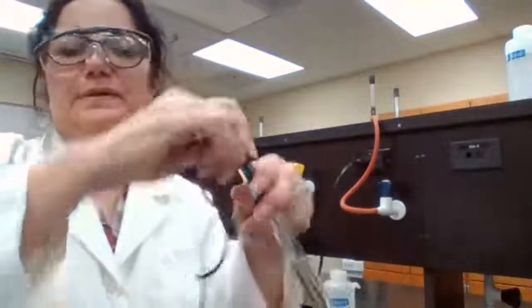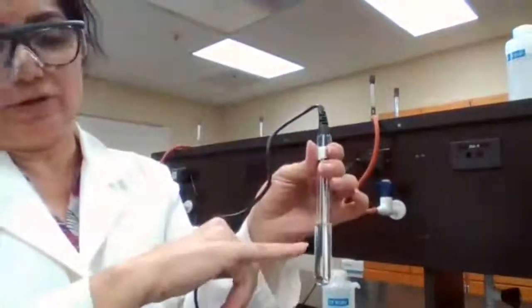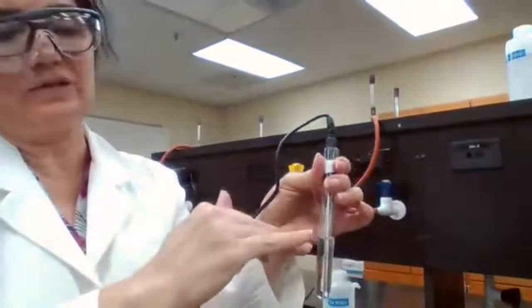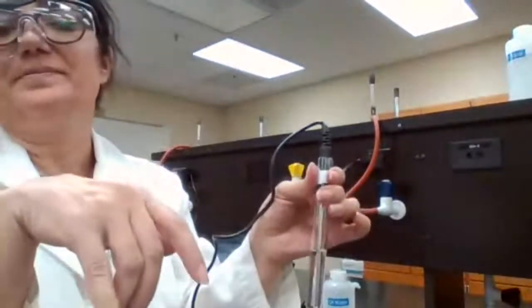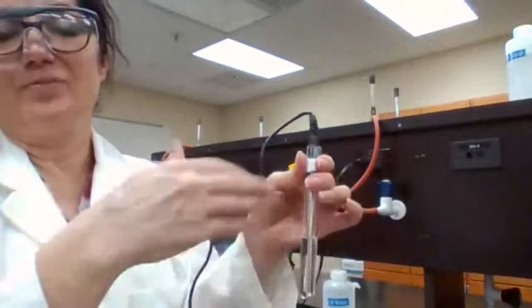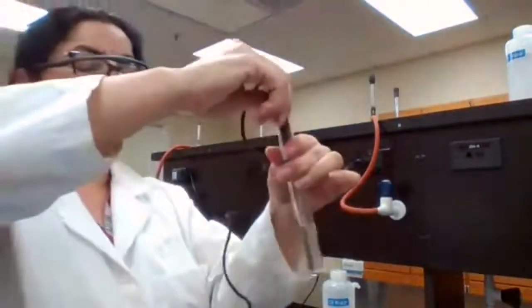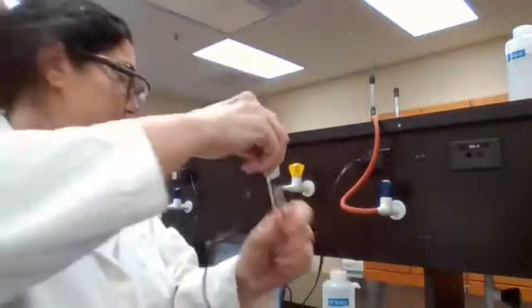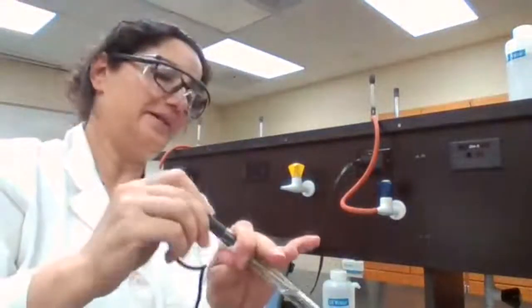Third test tube, and with the third test tube, the temperature that crystals are going to form, or the temperature that it dissolves, it should be higher than the 45, right? Because you have more sample in here. So it should be higher than the 45, but we don't know what temperature it is yet until we know that at 75, it didn't dissolve.